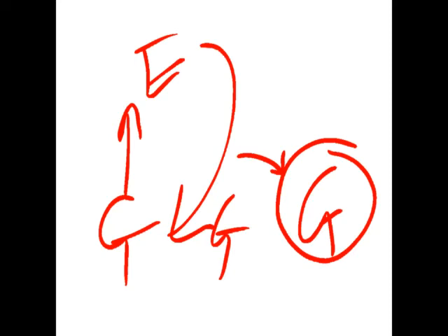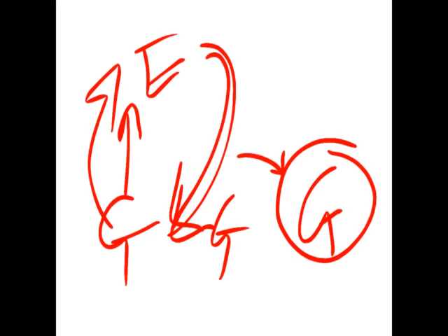So in flame photometry, the element goes from ground state to the excited state, again from excited state to the ground state, and the energy is emitted. That is the principle of flame photometry. But in case of atomic absorption spectroscopy, we are measuring the elements which remain in the ground state. The measurement of the energy they absorb is the principle of atomic absorption spectroscopy.